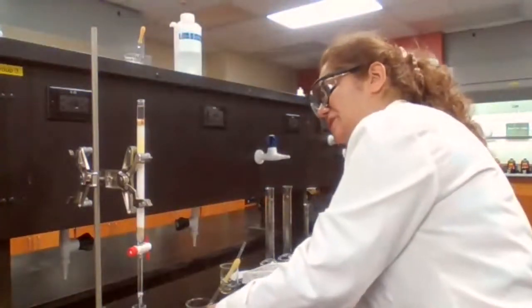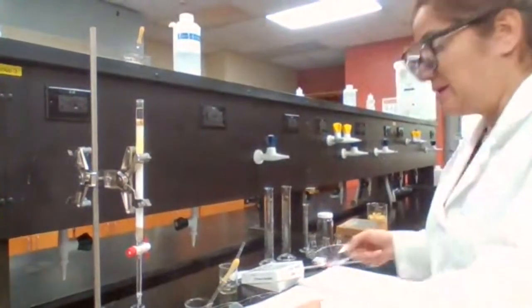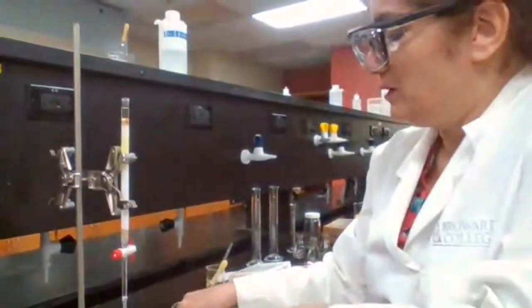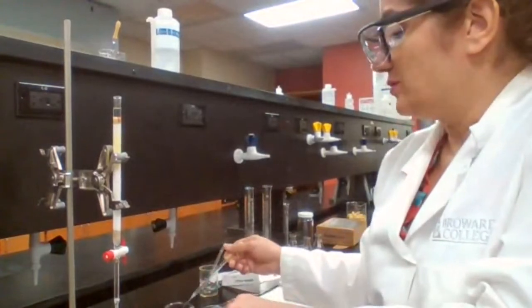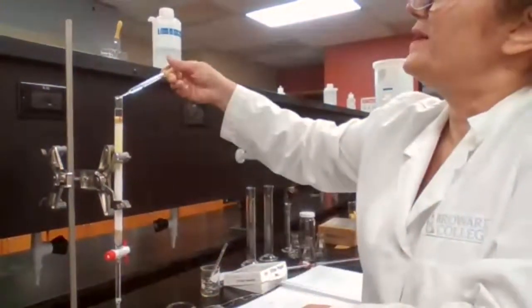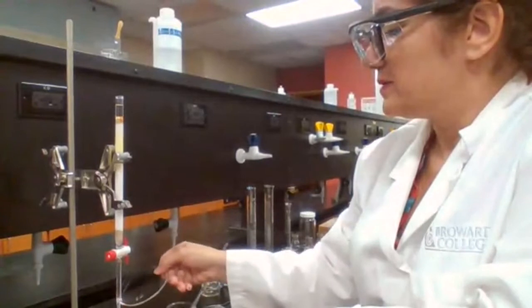Usually, when it reaches mark 20, based on experiments that students did in the past, it's just like 20 to 25 milliliters of the hexane collected in the flask. It's usually the time. But I don't trust that volume. I trust the formation of white residue, or no residue. So I have to test it.